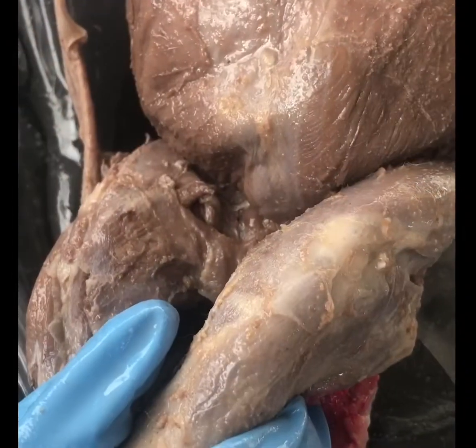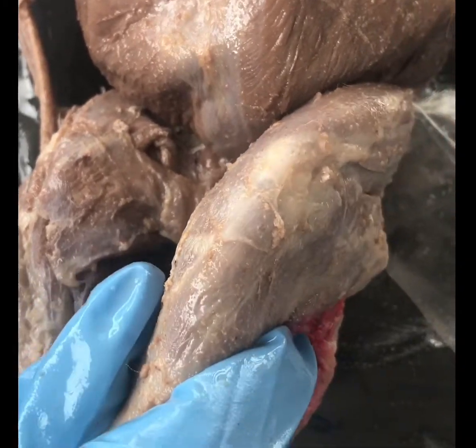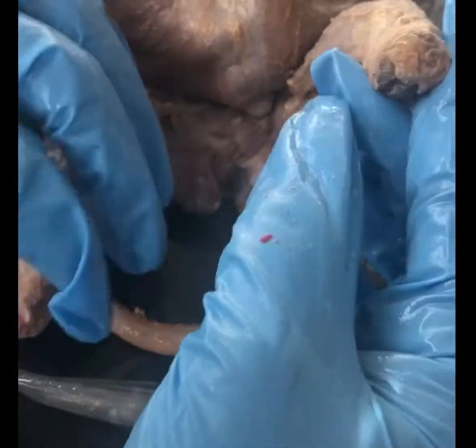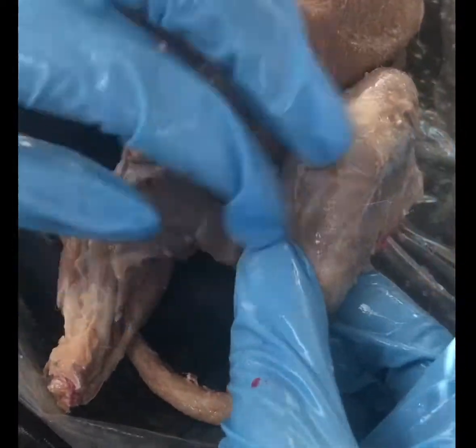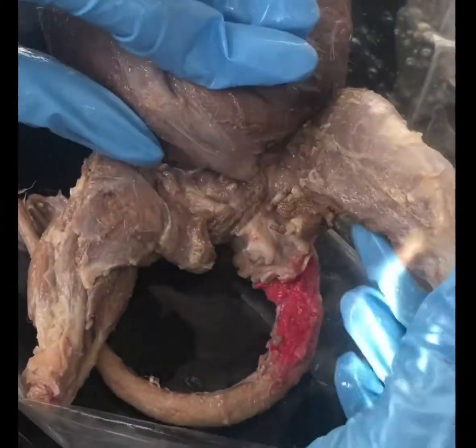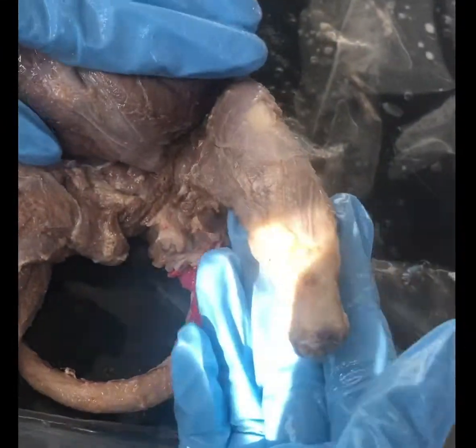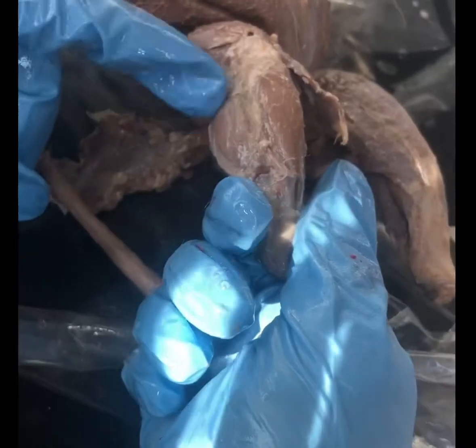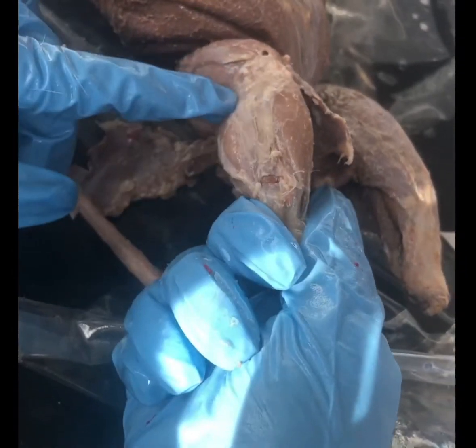Okay, and the last one is the fibularis longus, which everts the foot outward. So we don't have like under the, the kneecap is like right here, I think. So it'd be on the side. It'd be this muscle right here on the side. This right here.